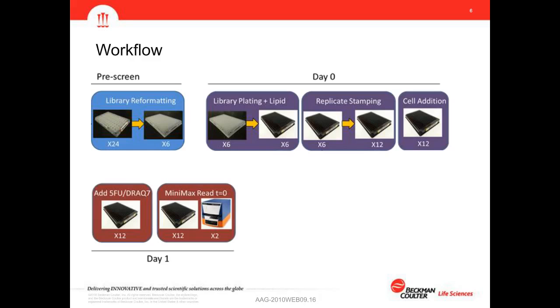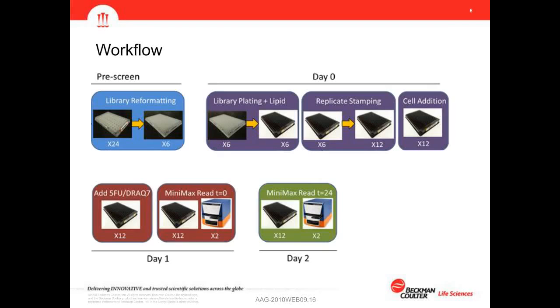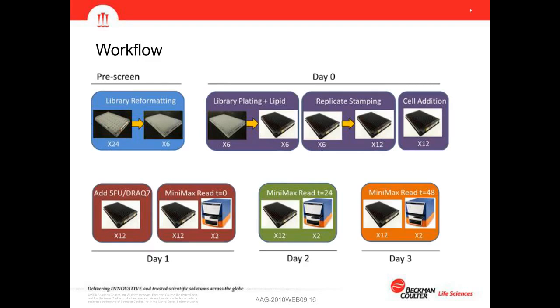And again, measuring at day 1, we were identifying microRNAs whose overexpression was sufficient to induce cytotoxicity in cells. We then reanalyzed the cells 24 hours later, so now the cells have been in the presence of 5-fluorouracil for 24 hours, and here we would hope to identify microRNAs that could enhance the toxicity of 5-fluorouracil. We then ran the analysis again at day 3, and now most of the cells will have undergone apoptosis due to 5-fluorouracil, but we might be able to identify microRNAs that could actually inhibit this process, and those microRNAs could then be future targets for chemotherapeutic intervention.